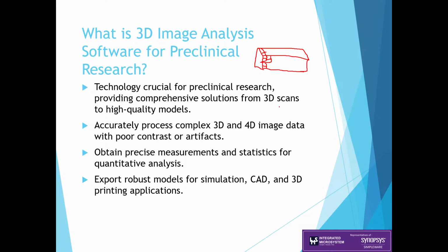time frames. And once the segmentation is done, we can easily visualize the results corresponding to any time frame required. Apart from this, we are also given robust measurement and statistics tools to do any sort of quantitative analysis. For example, doing a point-to-point analysis, taking a femur bone. If we need to do a lengthwise measurement, we can select the particular point, and this way we can do whichever measurement is required.